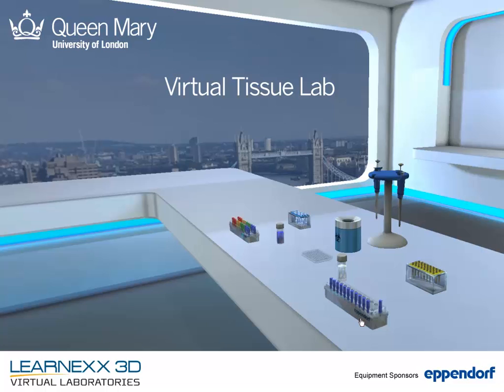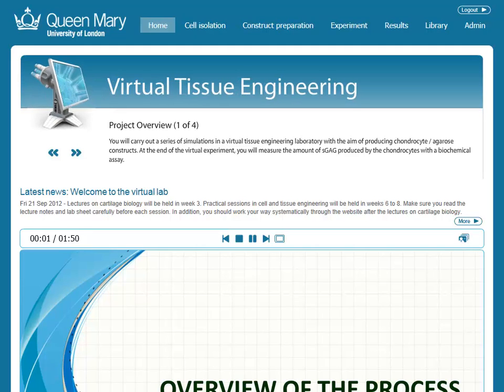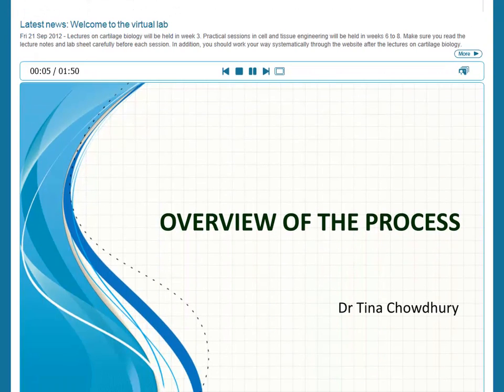The Queen Mary Virtual Tissue Lab takes students through the process of growing new healthy knee cartilage using a state-of-the-art bioreactor only available in research labs.